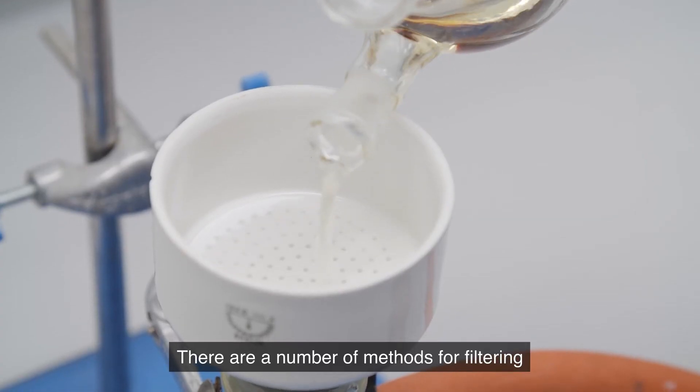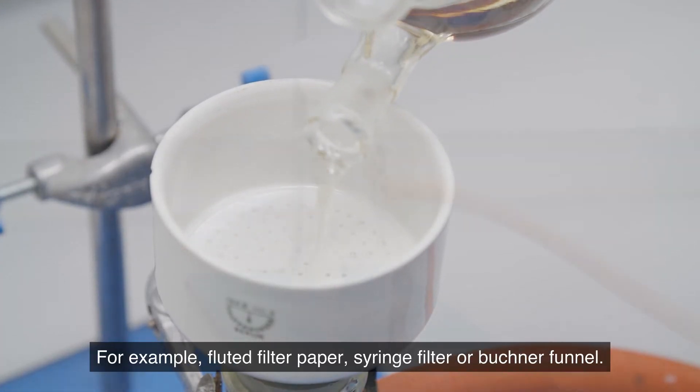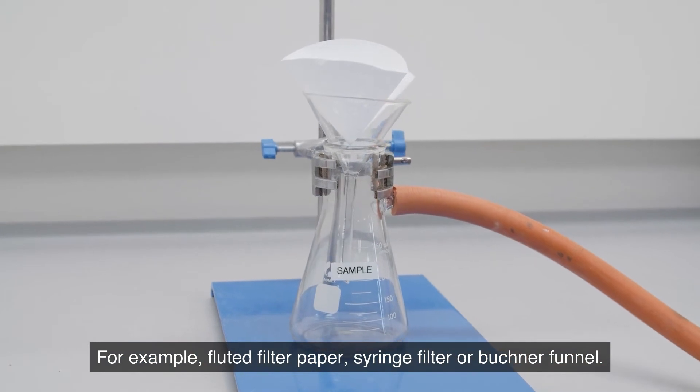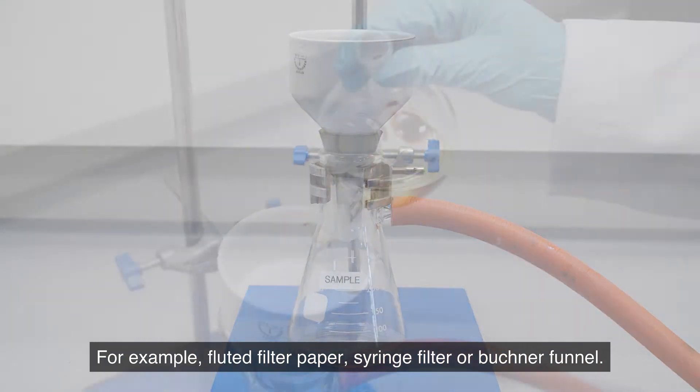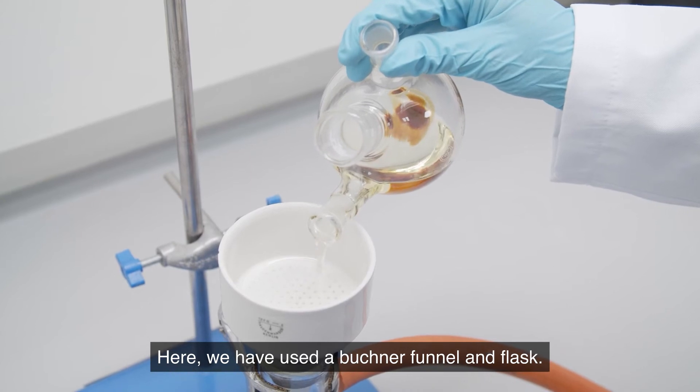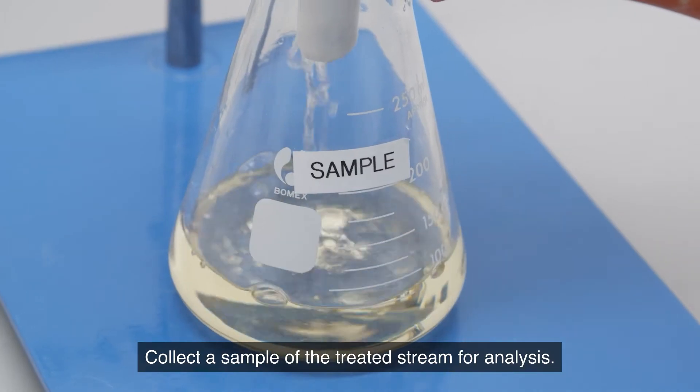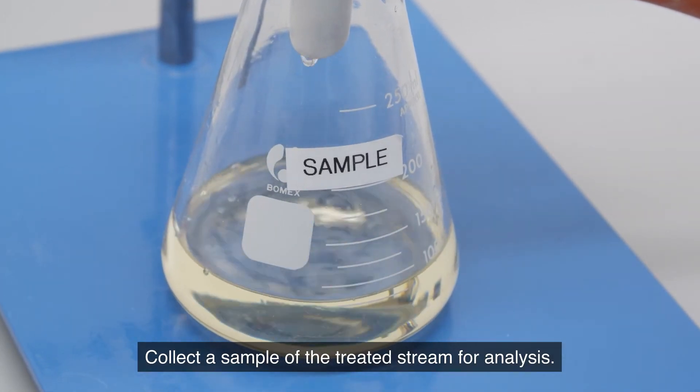There are a number of methods for filtering. For example, fluted filter paper, syringe filter or Buchner funnel. Here we have used a Buchner funnel and flask. Collect a sample of the treated stream for analysis.